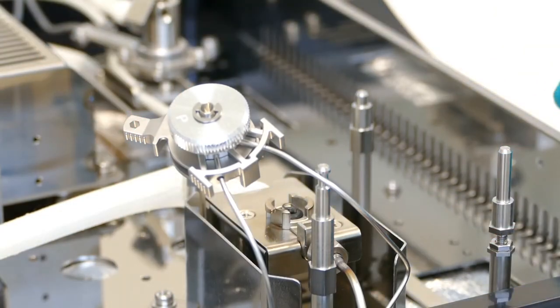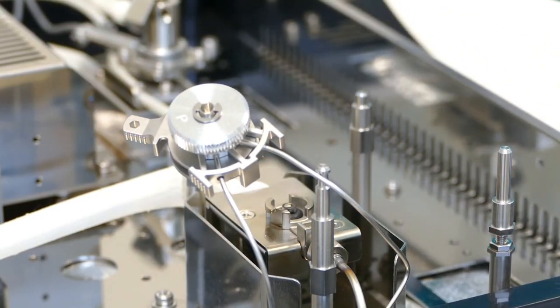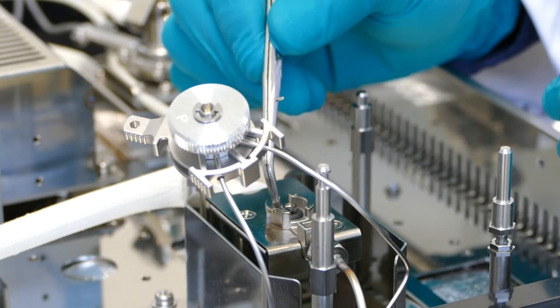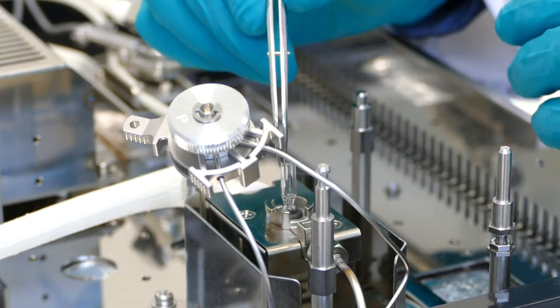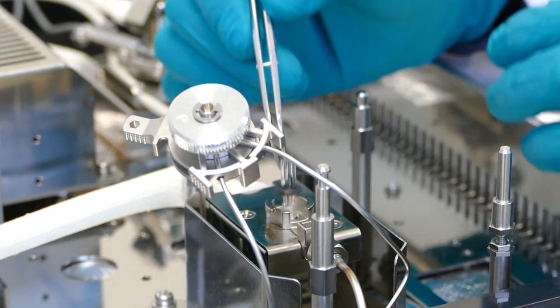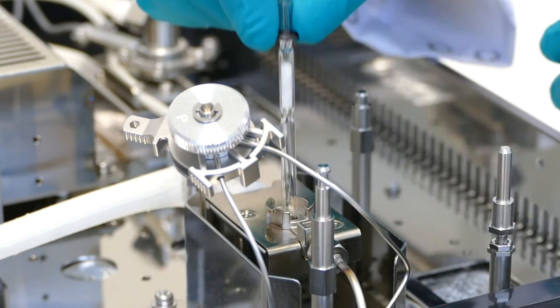To change the liner, release the latch on the injector. If the o-ring inside the injector is stuck, loosen it with tweezers from the side. Avoid pulling on the liner to prevent it from breaking. Once the o-ring is loosened, the liner can easily be removed.